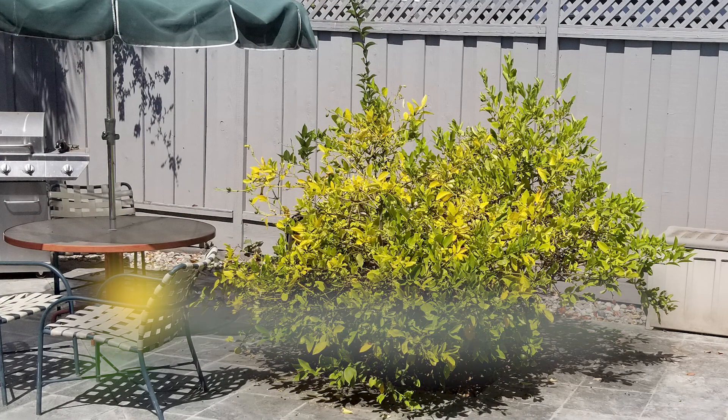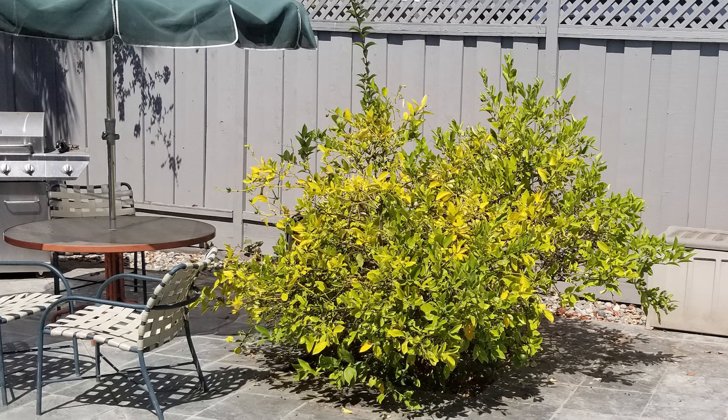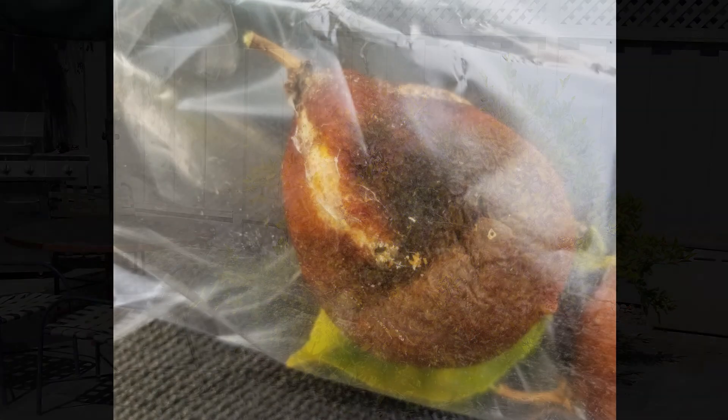This is the tree that we're going to investigate using our stereo microscope by sampling the leaves and the fruit. This was supposed to be a nice supple yellow lemon, but instead it's all sucked up and disfigured with a little hole in its side.